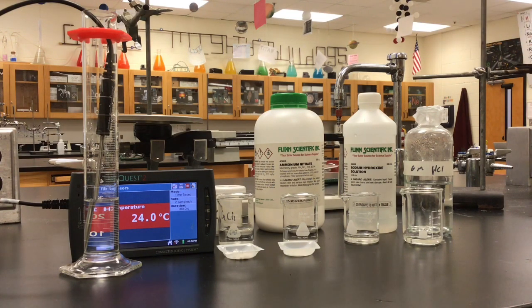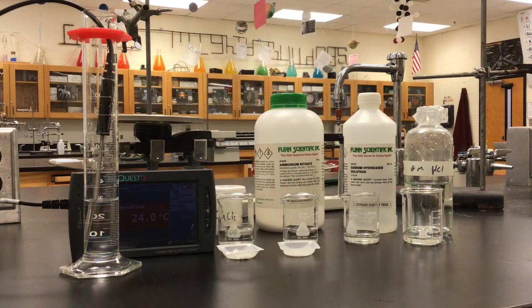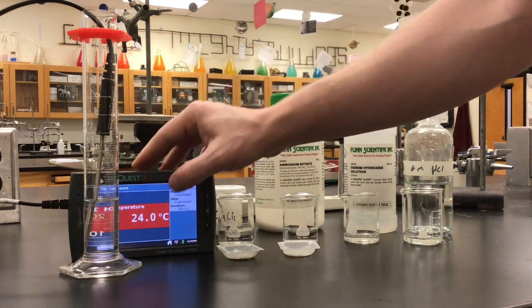If you have questions about that, you can, of course, let me know. But it's pretty easy to determine which one is exo and which one is endo. Exo gets hot. Endo gets cold. But you've got to think about that in terms of system versus surroundings.